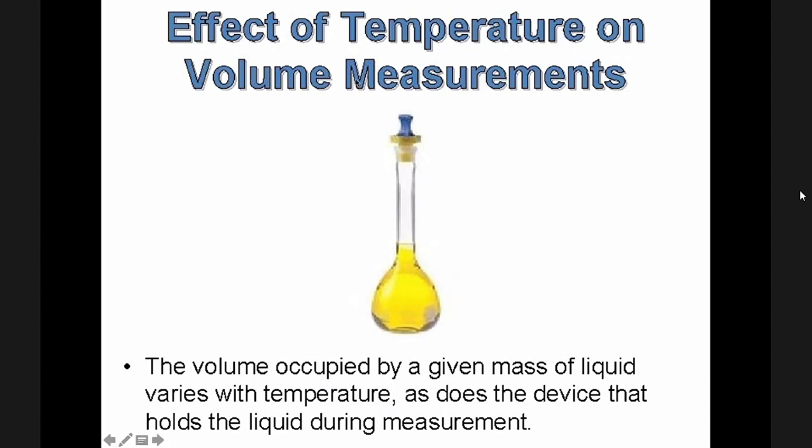What is the effect of temperature on volume measurements? Here, it is stated that the volume occupied by a given mass of the liquid varies with temperature.